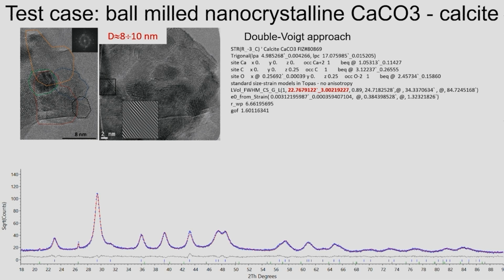So this is my definition, by the way, because coherence, when you use powder diffraction, is not an issue. We have beams which diverge like this and converge like this. I mean, coherence is not what we are after. So our meaning of coherence means within the same crystalline domain, basically. So you can call them crystallites, which is also good. You want to call them domains or give it another name.